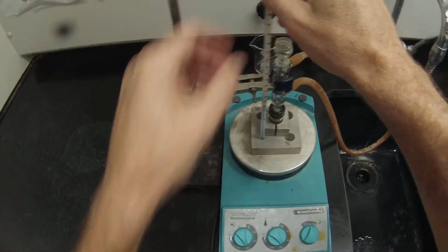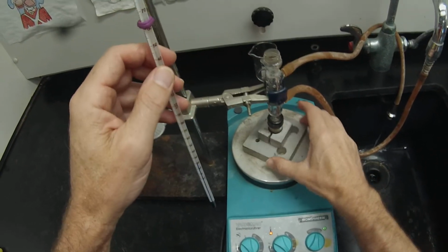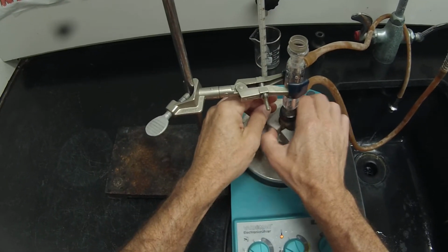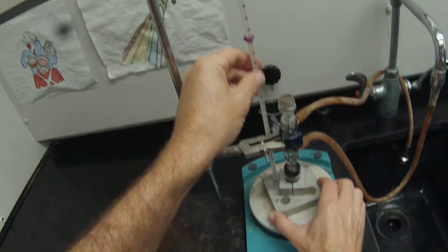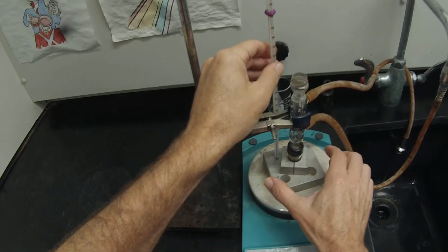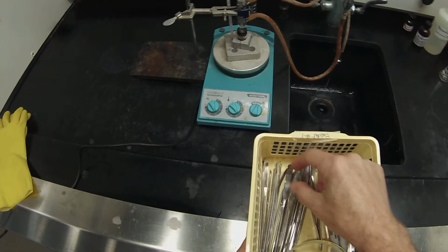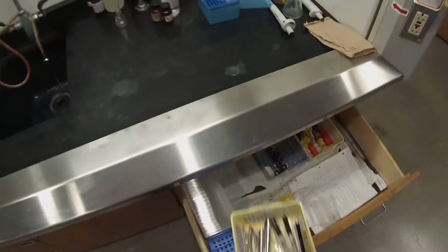I'm going to put a thermometer in there so I can monitor the temperature of the block. And I'm going to actually tilt this a little bit so I can put the thermometer back behind so it's out of the way, no risk of breaking it. And we'll just let that heat until it heads up to about 140. I'm going to get a spatula at the ready, one of the medium-sized spatulas. I don't need it to be bent, which will allow me to move that block around without hurting myself later.